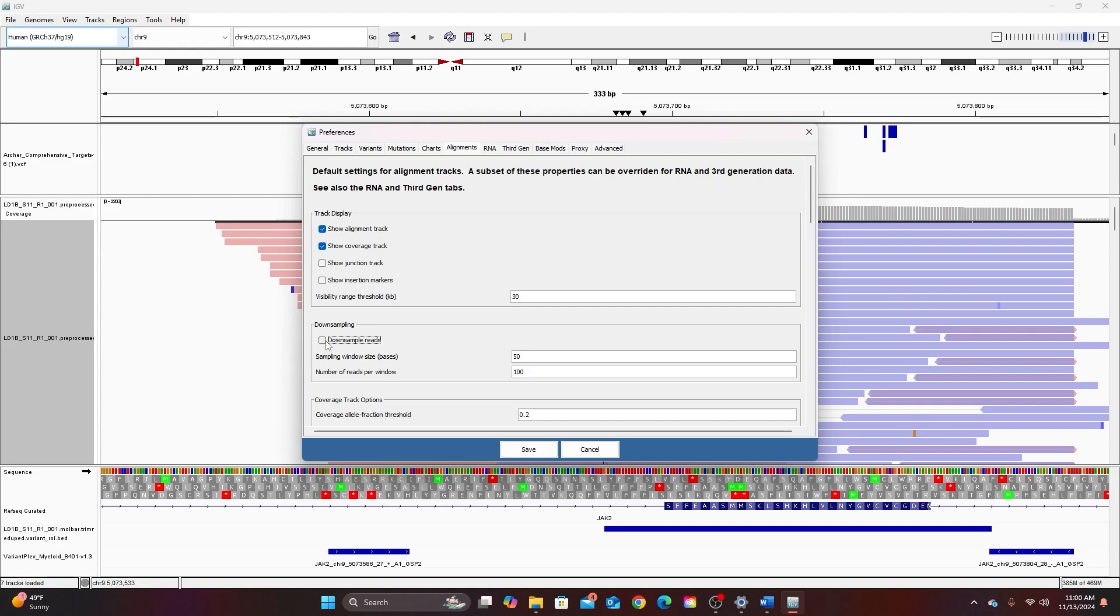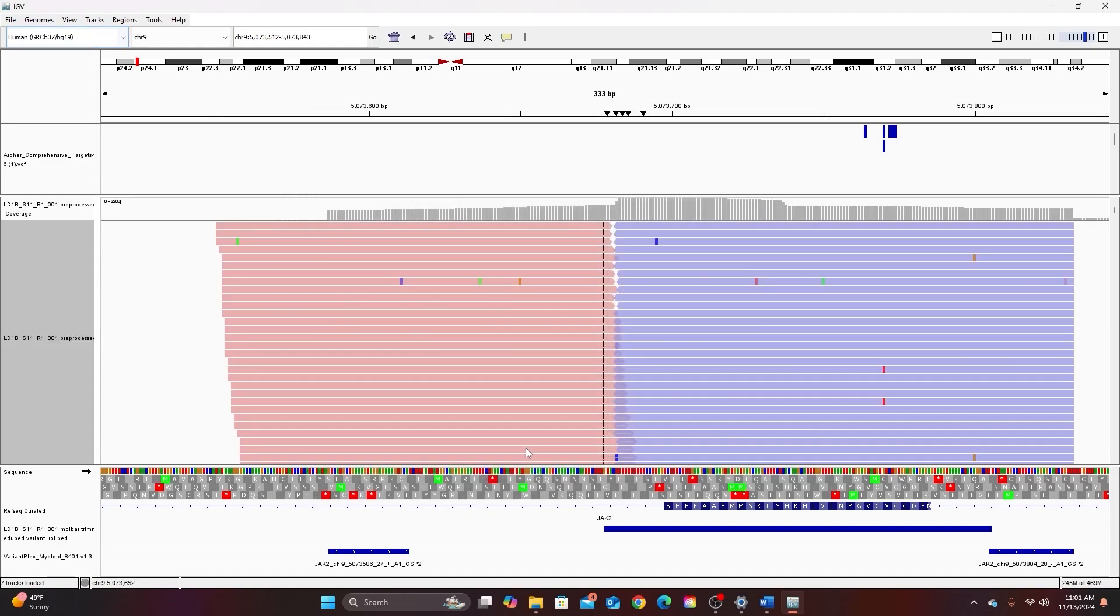Downsampling is something that the software does so that it has an easier time more quickly opening alignments. Downsampling is taking a random subsample from the full data set so proportionally all the sequences should be the same as in the full data set because it's a random sample, but if you're looking for rare variants they might be excluded by downsampling. So if you really want to make sure that you're not missing anything you can unclick this. That can cause IGB to work slower because it's displaying more data but it will also help make sure that you're seeing all of the data that you're looking for.